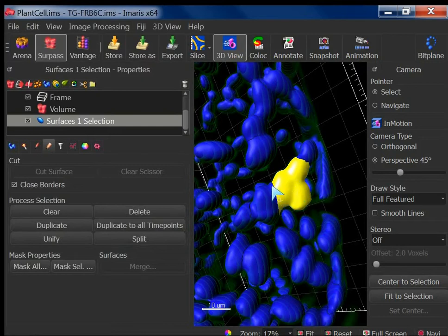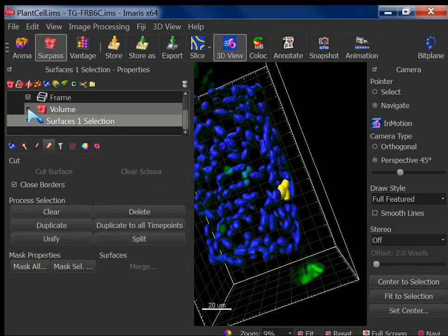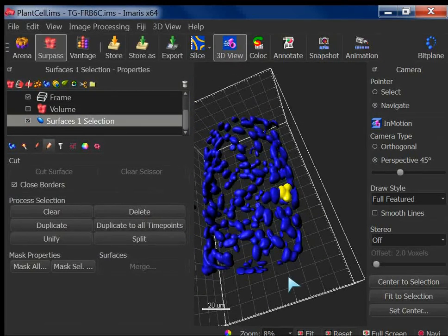Yeah, that's it. Very important property, and that's what we were discussing about this masking thing, right? So let's say you have created your segmentation like this. I switch off my volume, only I look at it. I don't highlight it. Also, maybe I should tell you now, it's possible to create a subgroup, right? I think I already showed you that. This one. So when you say duplicate, it will be duplicated.